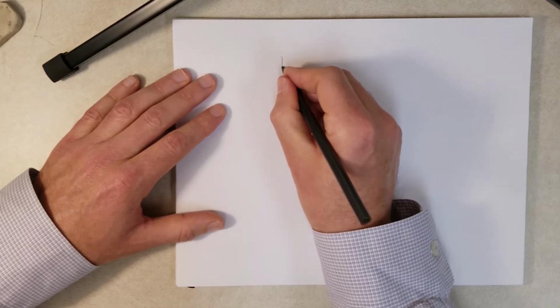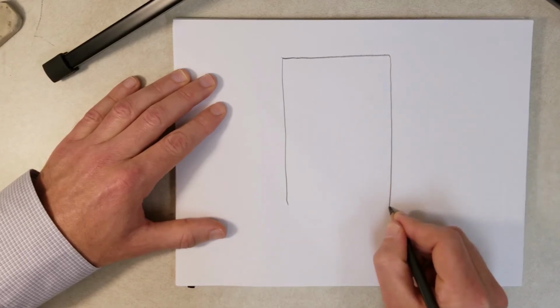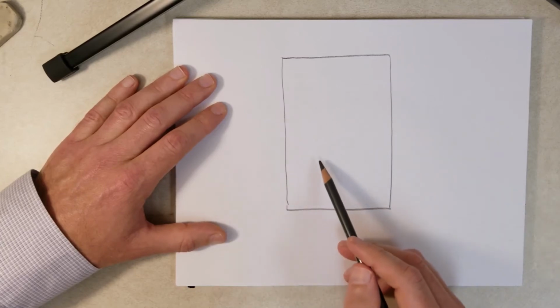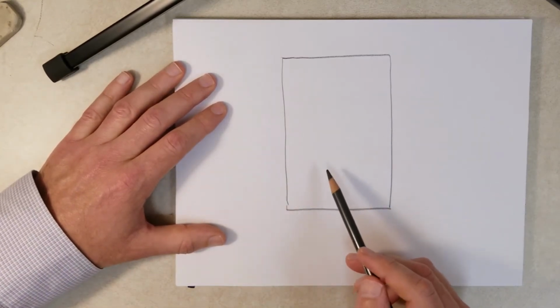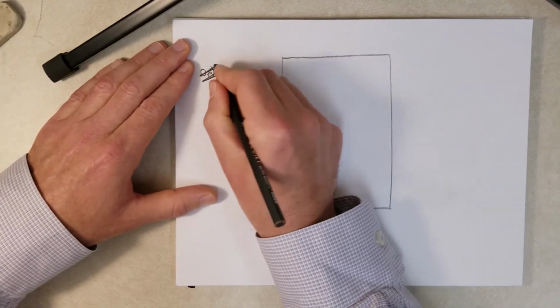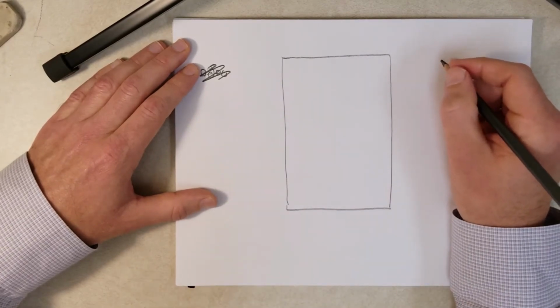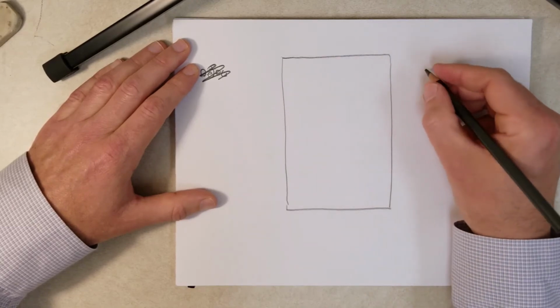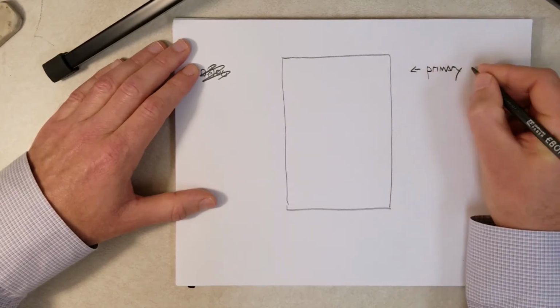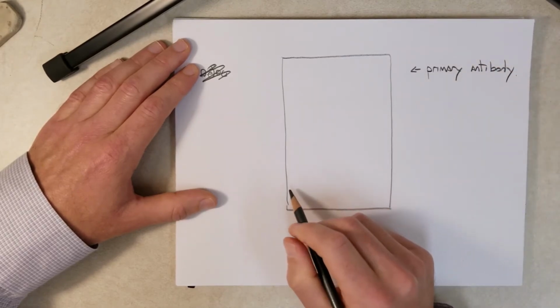And how do we do that? So here's the membrane now, and we can't see the proteins here. We could stain the membrane with a dye, but that's not necessary to make sure it transferred. We don't need to. But we can move on to detecting the flag CDC45 protein. And how would we do that? Well, we would incubate this with a primary antibody. That's the first step after transferring the proteins to the nitrocellulose membrane.